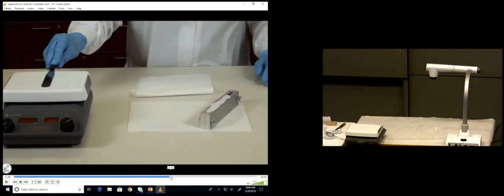Now we need to trim it. This has still been problematic, because we want to be able to trim it off and also polish it on the top. So make sure you use, and this is important, a large metal spatula, okay? Do not stick a plastic or rubber spatula on there, as it will melt, okay? That's a bad thing, right?